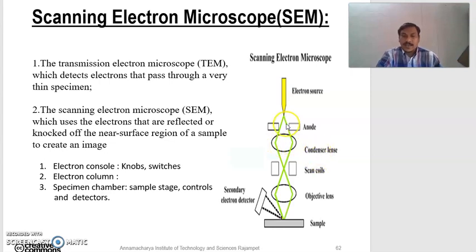So when the electron beam passes through the condenser lens, the beam is converged and passes through the focal point, so that the electron beam is focused down to 1000 times smaller than the original size. So condenser lenses are responsible for determining the intensity of the electron beam when it strikes the specimen.